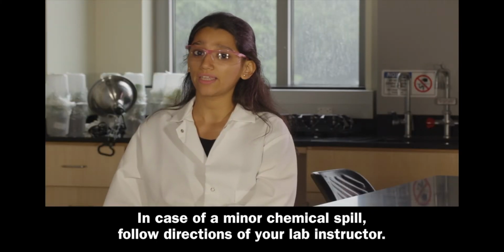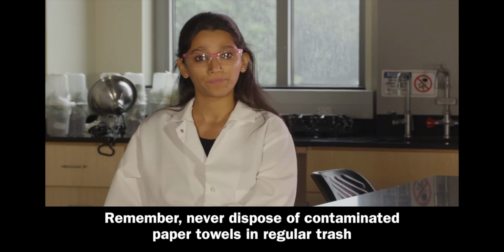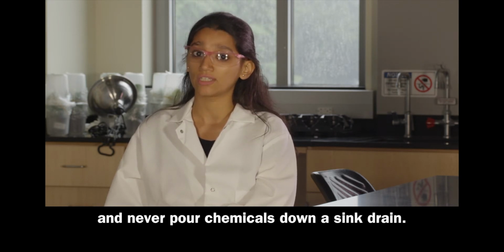In case of a minor chemical spill, follow directions of your lab instructor. If you're asked to clean up a minor chemical spill, wear appropriate personal protective equipment. Remember, never dispose of contaminated paper towels in regular trash and never pour chemicals down a sink drain.